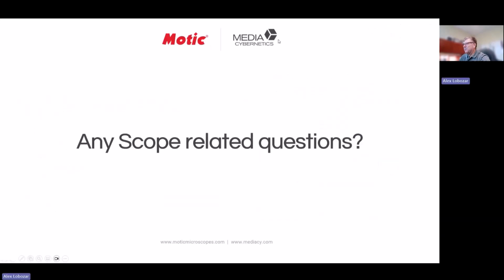All right, just before we break into the media side, we wanted to just section it off a bit. Any quick questions on any of the microscope topics that we went over? Please feel free to raise your hand or list that in the comments. I think May put a list out there, and we'd be happy to answer anything you have at the end as well if you want to just type it up. Okay, looks like we're clean.